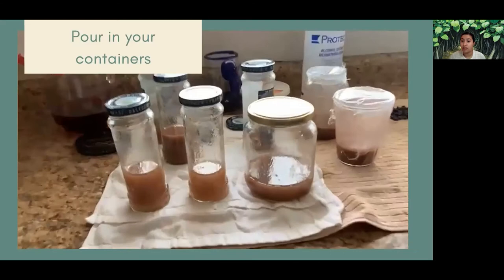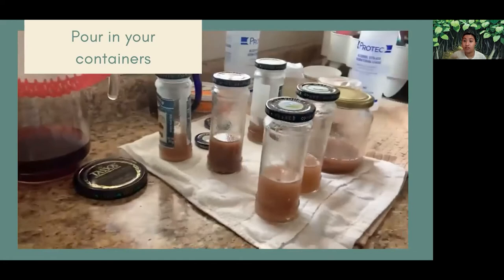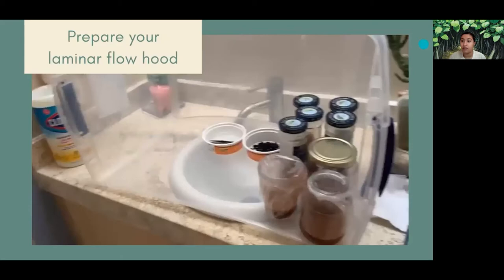Please close the lid while you are waiting for the agar to settle because you can have contamination if you don't close them. Then you're gonna prepare the laminar flow hood. Please clean everything with alcohol and detergent if it's possible.